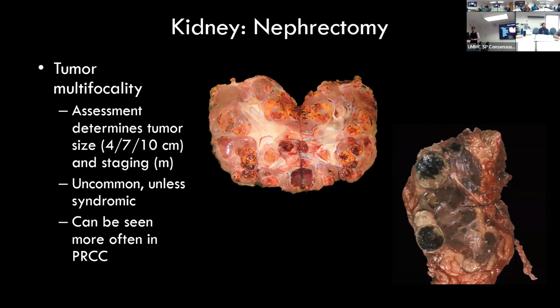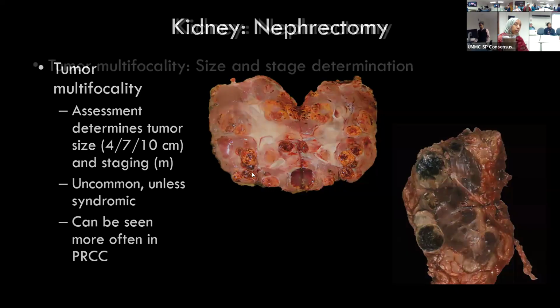They may develop multiple papillary RCCs, as you can see in this particular example, where the color is more pale tan yellow compared to the bright yellow of the clear cell renal carcinoma. And often these are hemorrhagic, and often these are all peripherally located with exophytic masses pushing into the perirenal adipose tissue. Okay.